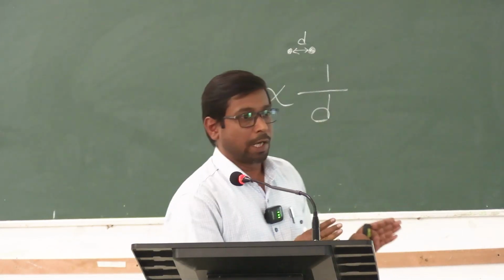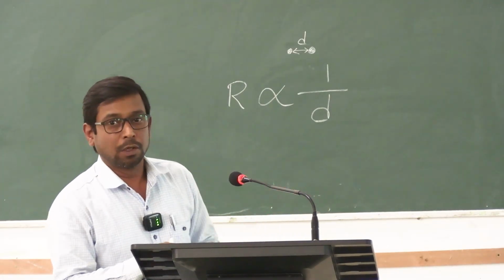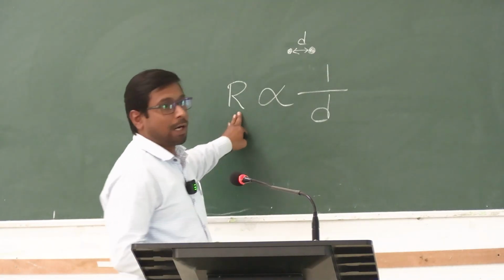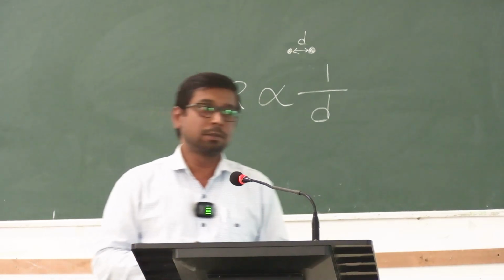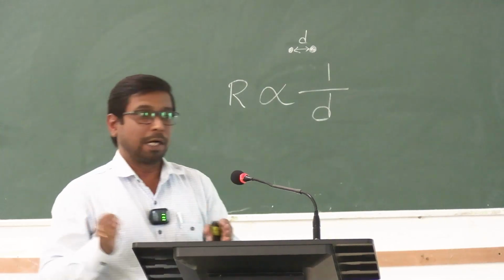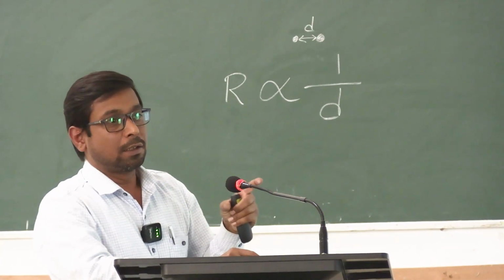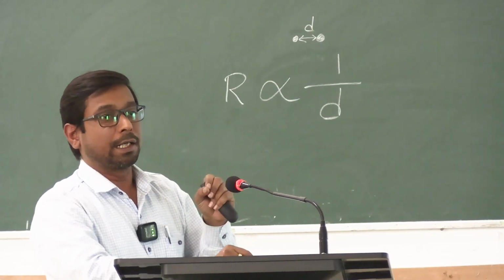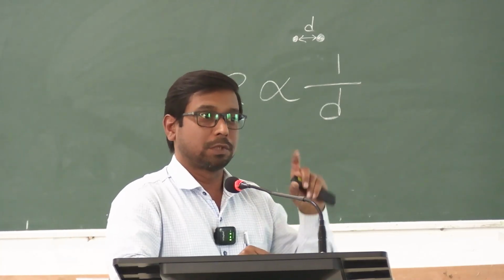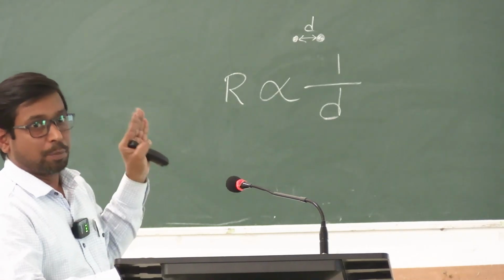Okay, slowly I will go and discuss a little bit, because it is more about physics and mathematics. If we want more resolution, magnification is a different part. We can increase it by lenses and so on, but at the same time we have to increase the resolution also. Otherwise we will not get a clear picture, right? We want a clear picture to observe that cell or cell organelles. That's why we need a crisp, clear picture.